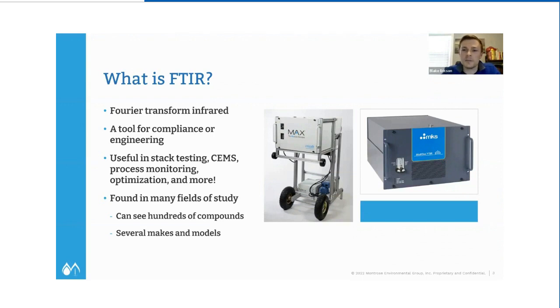It's a good tool for compliance and engineering. We use this in source testing for a whole slew of purposes, but one of the main ones is in performance stack testing for achieving compliance. And these can be used for everything from RATAs to CPTs on cement kilns to, you name it, destruction efficiencies on RTOs. There's a whole wide array of things that the FTIR can do. And it's also a really, really good tool for engineering.